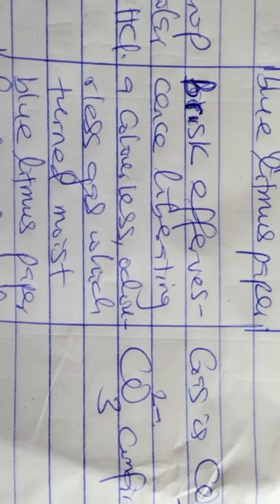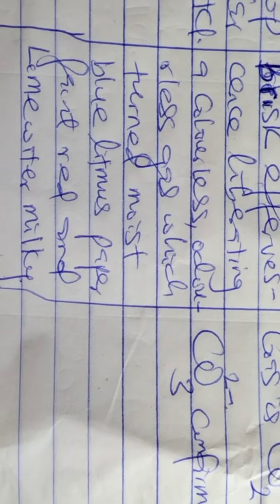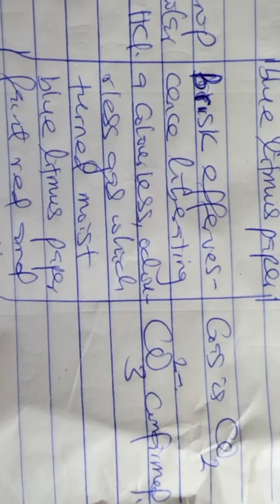You don't just say effervescence. Liberating a colorless, odorless gas, which turned moist blue litmus faint red, and lime water milky. Then gas is CO2, then CO3 2- confirmed. Gas is CO2 and then carbonate ion confirmed.